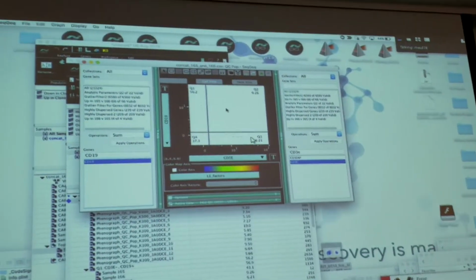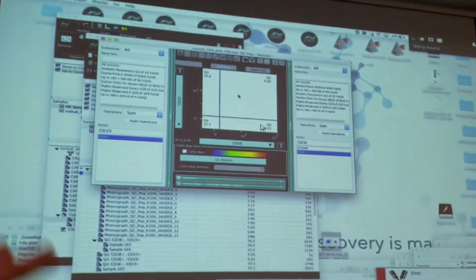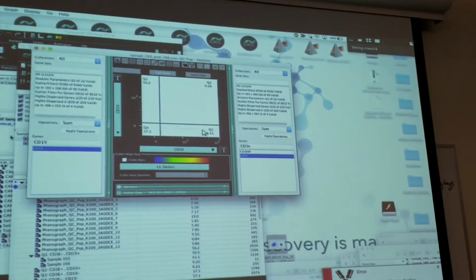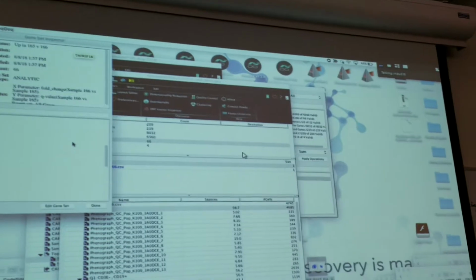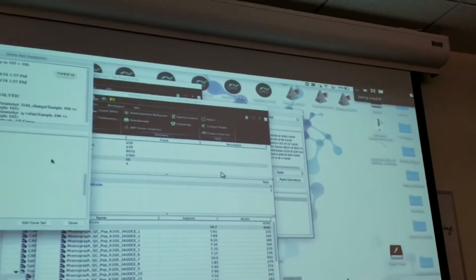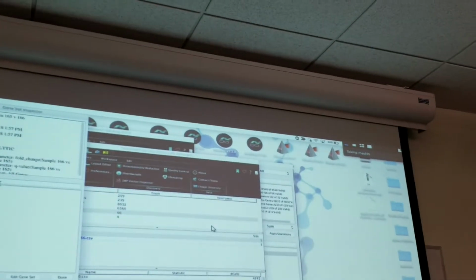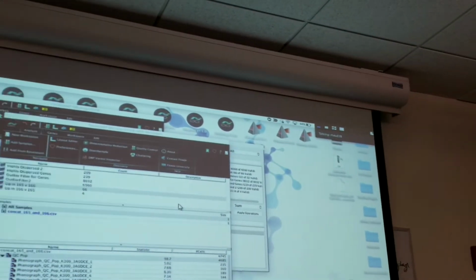It's just kind of interesting to look at the variation from what this found to what it matched to. It had a sequence, and it said, okay, what heavy light chain, what D region is this? And then it searches and it comes up with a name. And I guess that's not exactly the sequence that we have because it's just the closest fit, right?